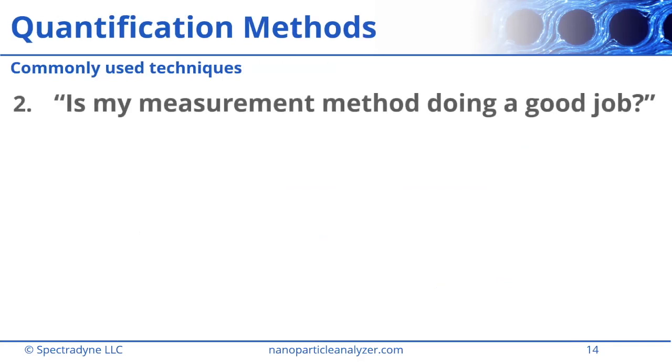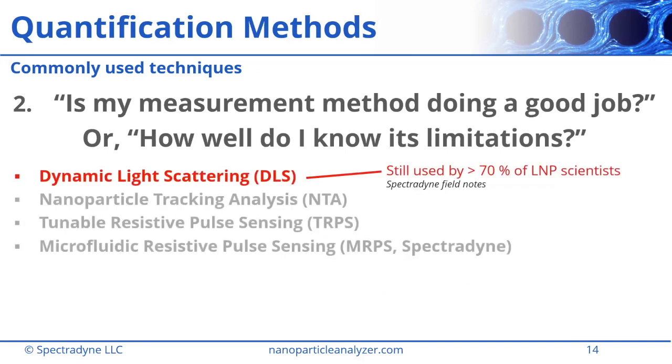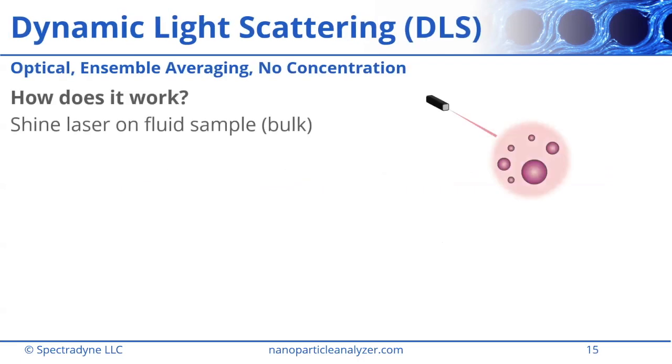So let's shift gears now to the second question, my second goal for the webinar, which is: is my measurement method doing a good job, and am I operating it in the appropriate regime for this technology? Another way to ask that is, how well do I know the limitations of this technology? And let's start by talking about dynamic light scattering, because in the nanomedicine world, for lipid nanoparticles, this is still a very common technique. Even though it can't deliver any concentration measurement, many people are familiar with this technology in this space.